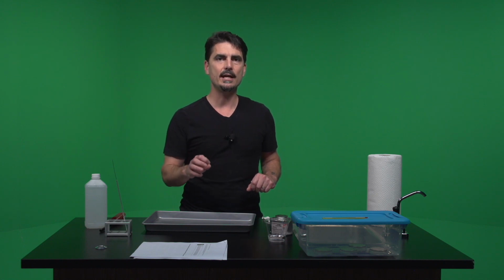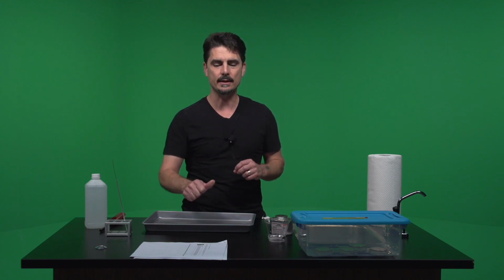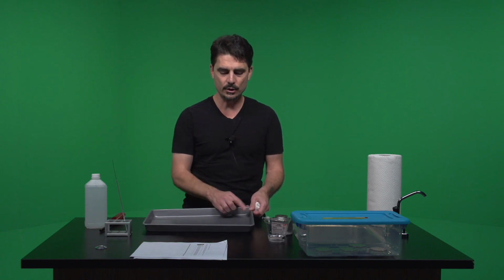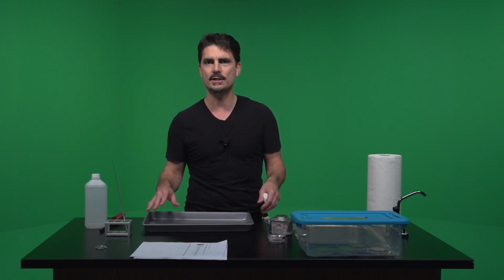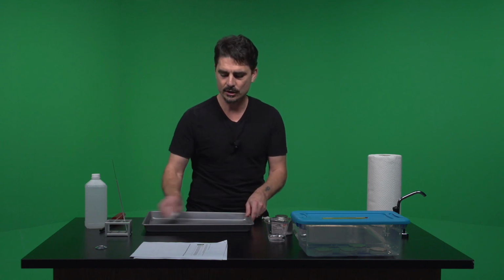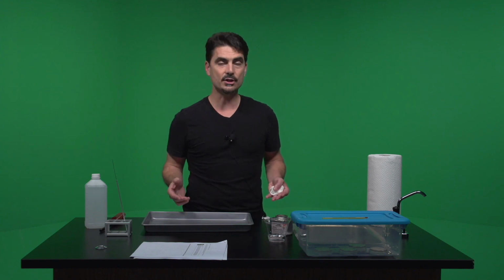And going back to the video where we were looking at the Clorox bottle, non-porous hard surface, no matter when you're doing microbiology, that is what you need. Hard and non-porous. So make sure that whatever surface you're using, it works. And if you're going to use a tray, don't use one that's got a bunch of ridges, like a roasting pan or something like that, because anytime you have other ridges, it's harder to clean up. Here we can just wipe it down really nice, and it cleans it very easily. Okay, so let's go ahead and wait 48 hours, and we'll be back to look at our plates.